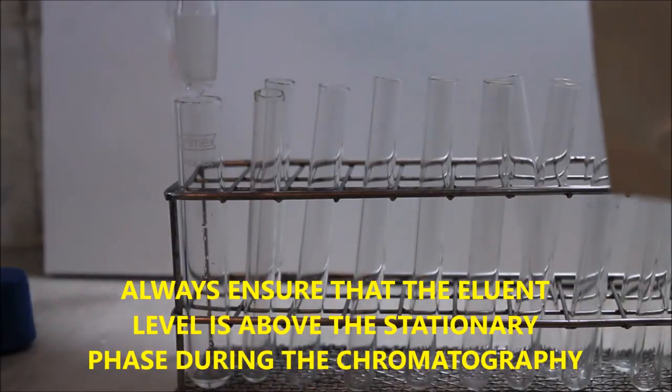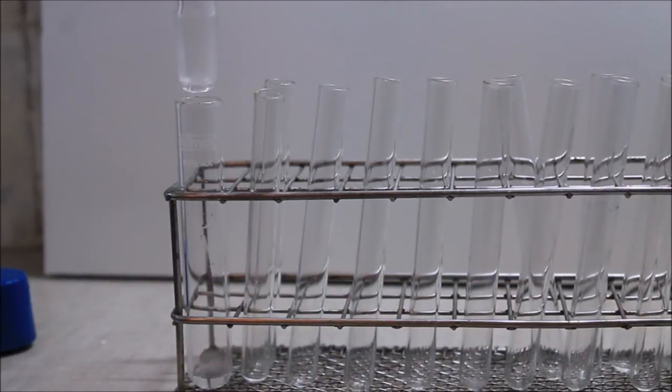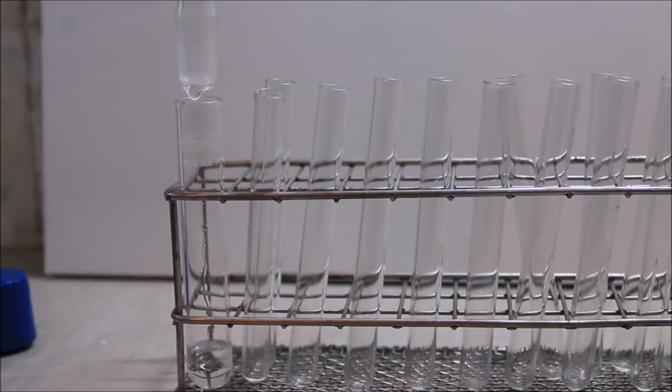Then the mobile phase coming out of the end of the column is collected in small test tubes. In this case, the chromatography can be followed by the color of the solution coming out from the column. In the case of colorless analytes, the chromatography is typically followed via TLC. Pressure can be applied to accelerate this process; this is known as flash chromatography.